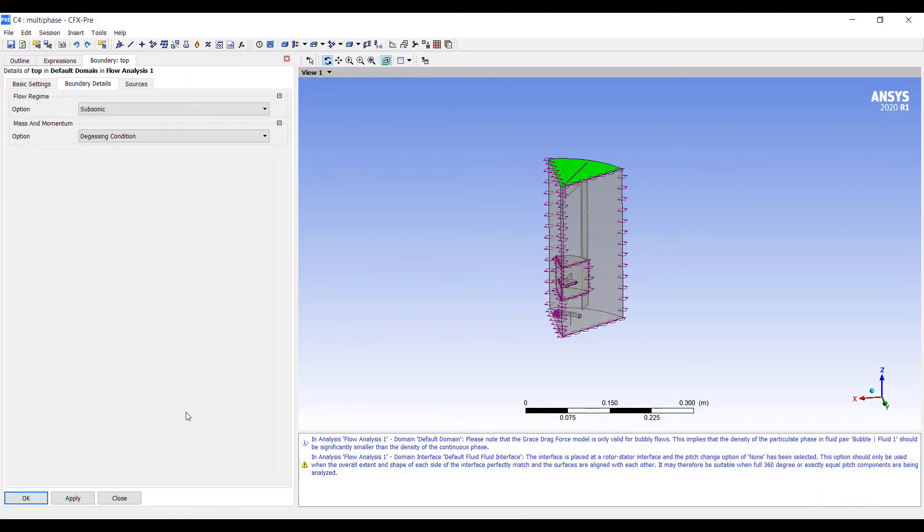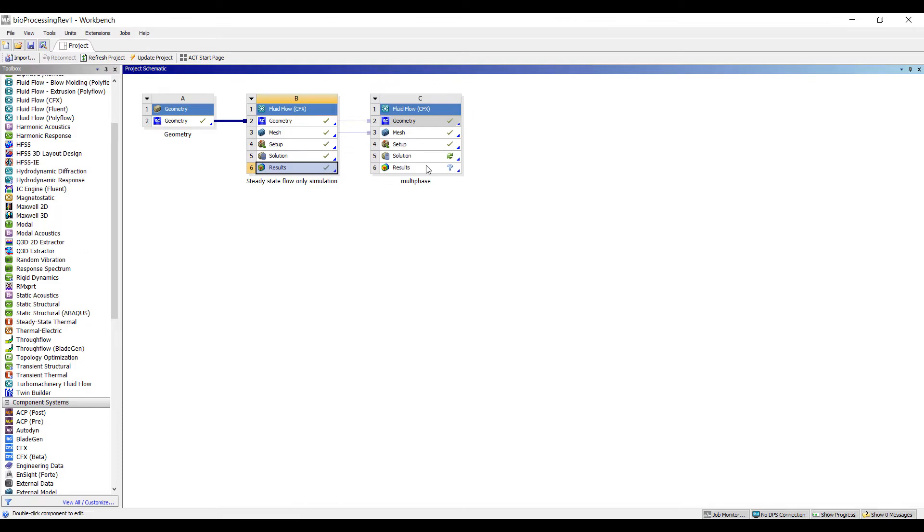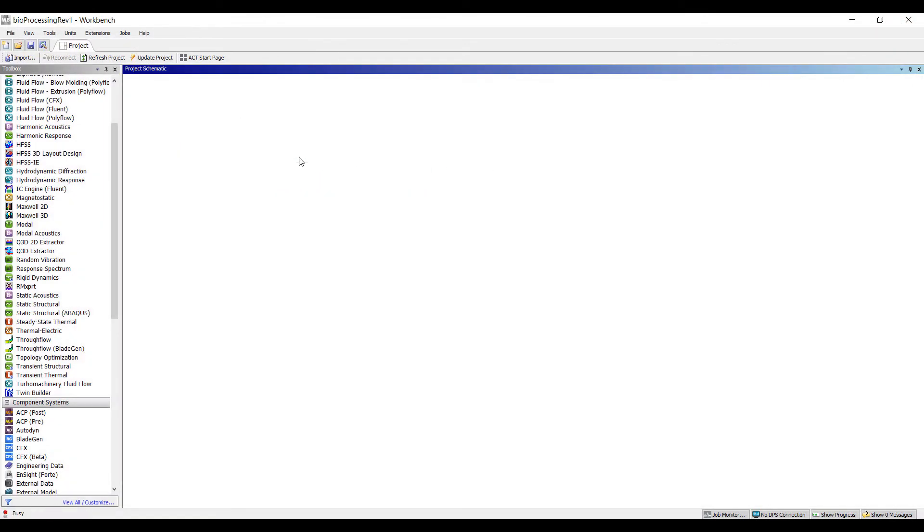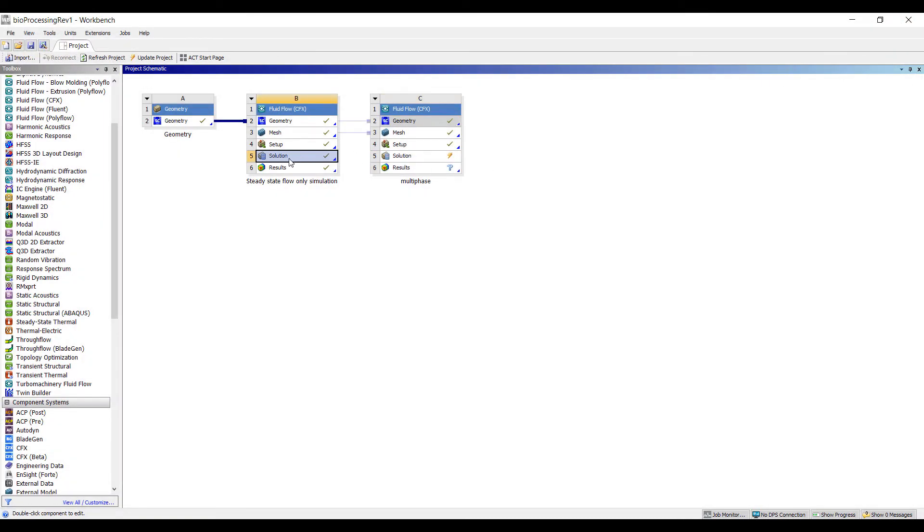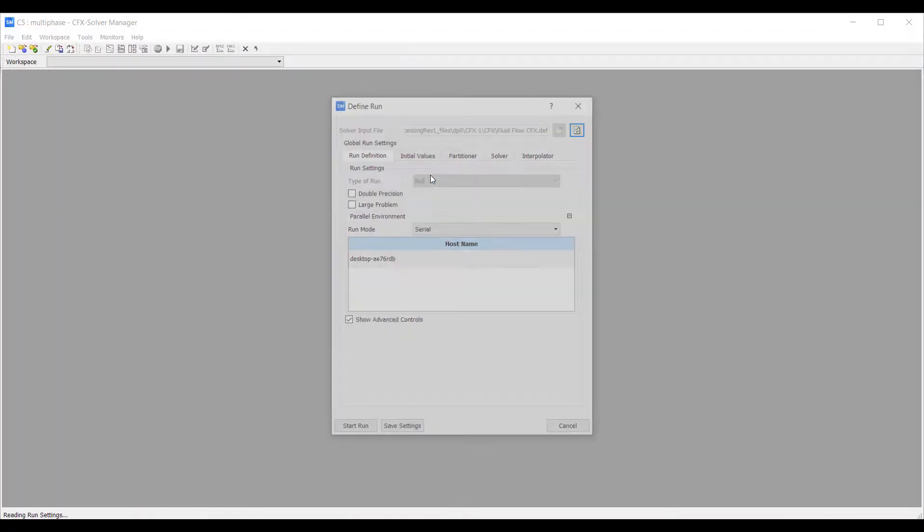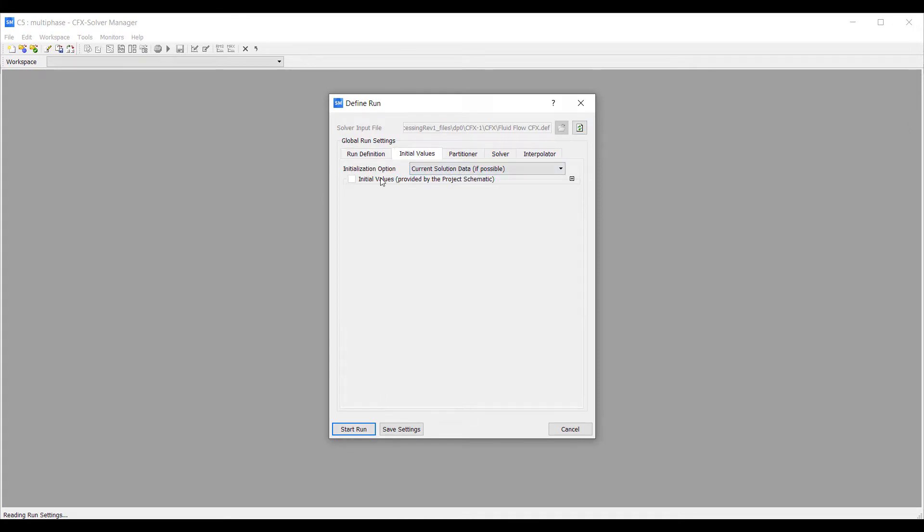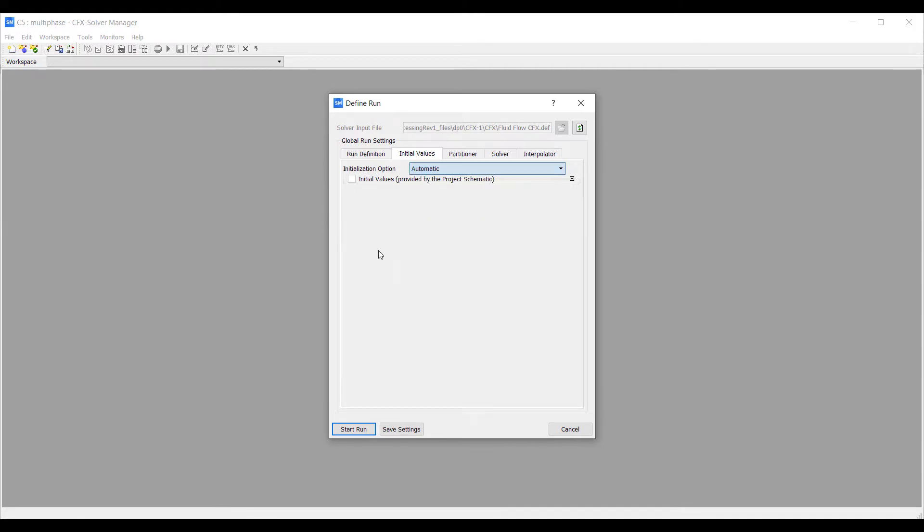Let's go ahead and run the simulation. To run the simulation, we want to connect the solution from the previous analysis to this one. This allows us to make use of the initial conditions generated by this model, and that should make the simulation much faster. Initial values provided by project schematic.